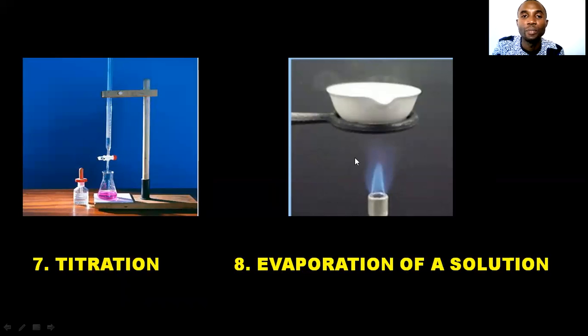We have talked about it. This is a Bunsen burner and all of that. This is another, that is number 8. In chemistry, we are talking about laboratory setups.